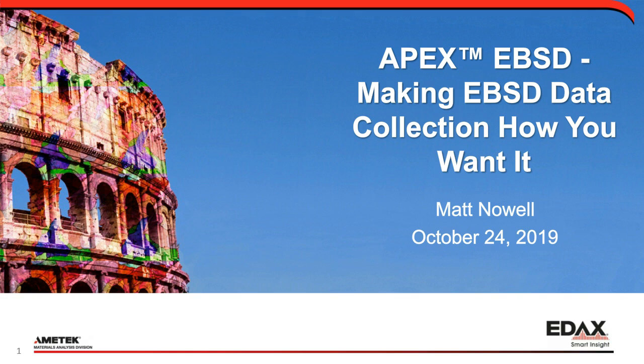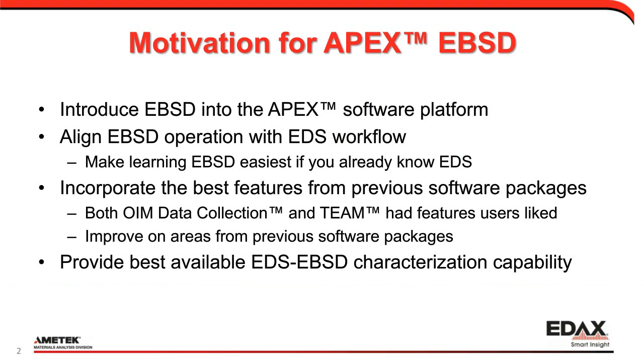So to give a little background on this, there's a few things we wanted to accomplish with APEX. First, we wanted to introduce EBSD into the APEX software platform. I'll detail in the next slide, but APEX was first released for the EDS product line and has been continually growing in capability and feature sets there. Bringing EBSD into this is the next step in expanding the characterization capability of this software platform.